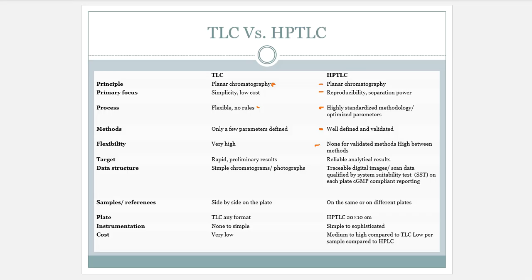Flexibility, you get none. That's it. You have to follow the method. You follow the SOP. You follow the plate application methods. You have to abide by the USP and so forth. But your flexibility for a TLC plate is very high. You choose little ones, you choose small ones, you choose different sizes. Folks, that's up to you.